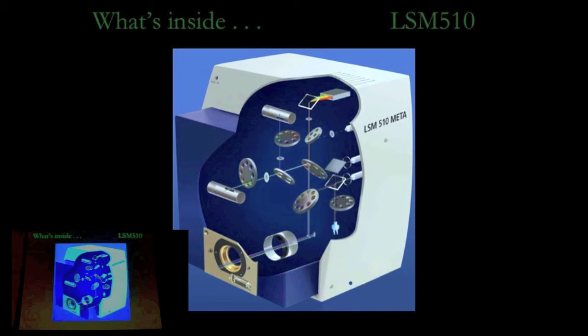At the back of the scan head, the laser light is brought in on fiber optics, and those are combined. Then there's a primary beam splitter that's going to reflect the desired laser excitation lines down to the mirrors. And on the way back through, the emitted fluorescent light will pass through that mirror.